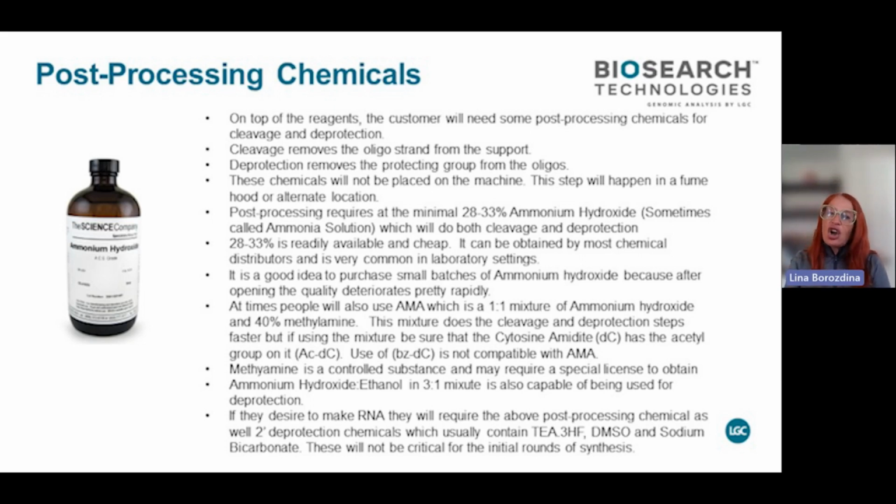Also for the RNA, there's a few things you would want to do. RNA is way more sensitive. So I wouldn't recommend using AMA on the RNA strands if you're doing siRNA, CRISPR, etc. Or if you use oligos to build the genes, because AMA does have properties that will damage the DNA or RNA in that situation.